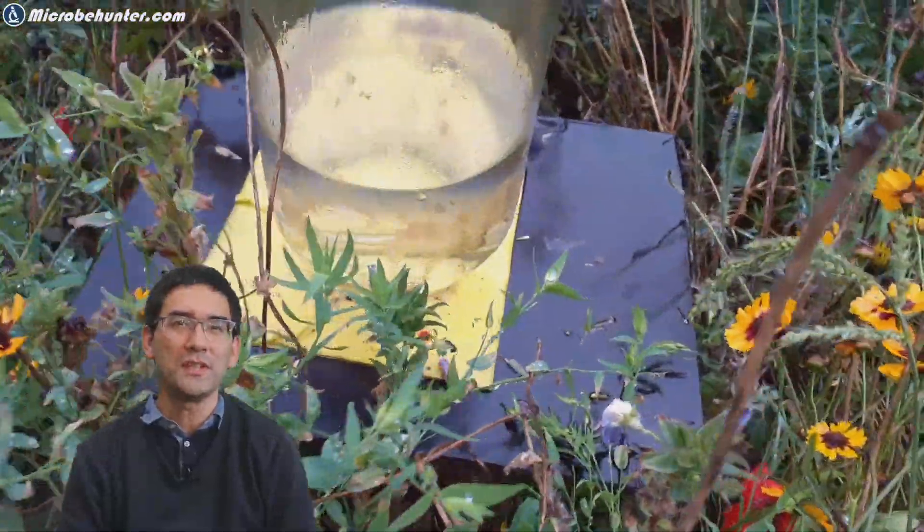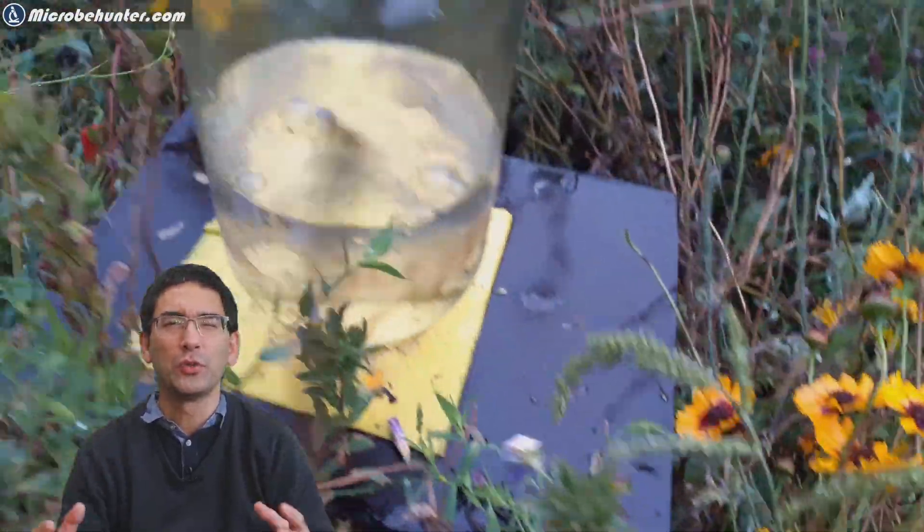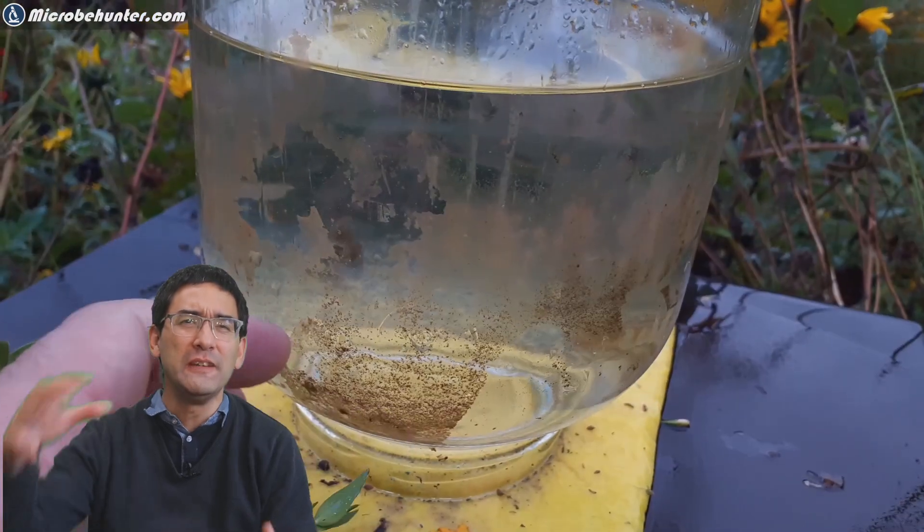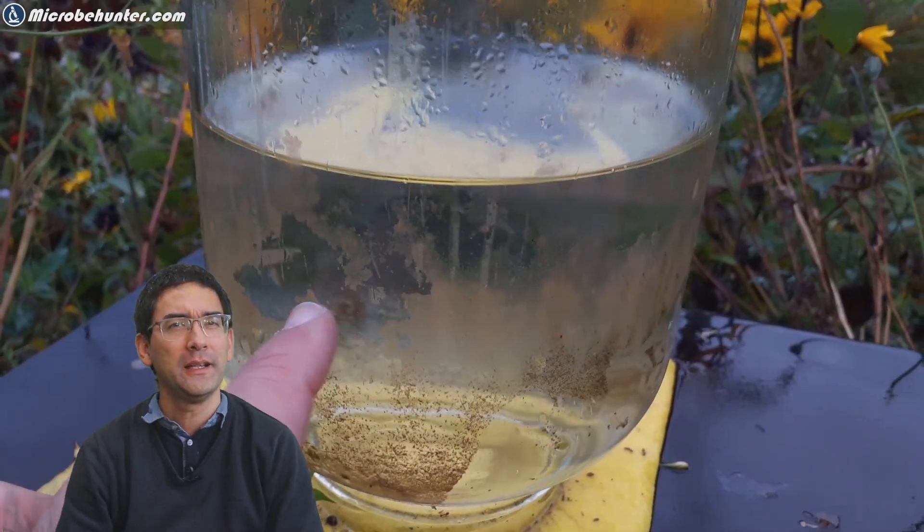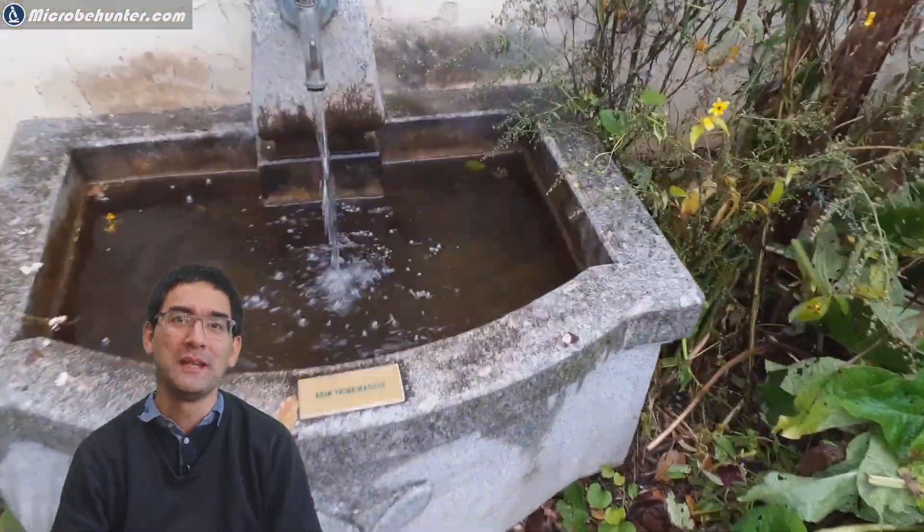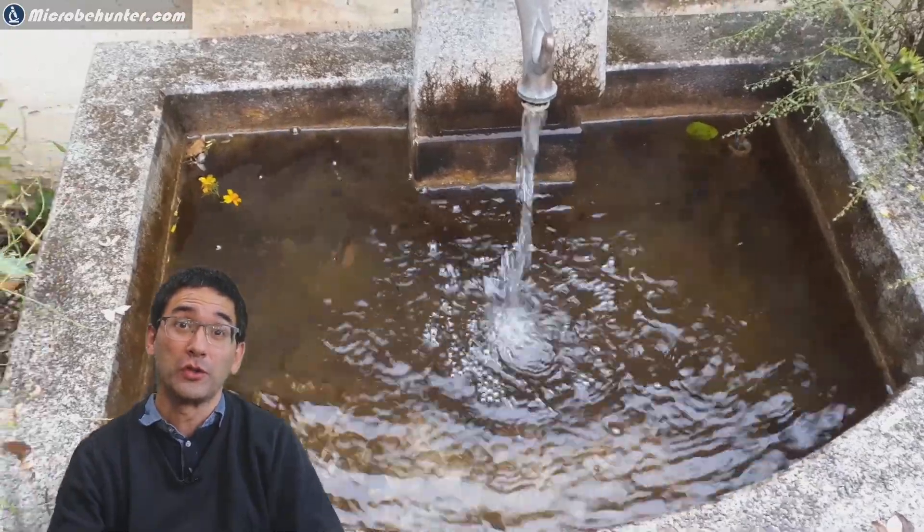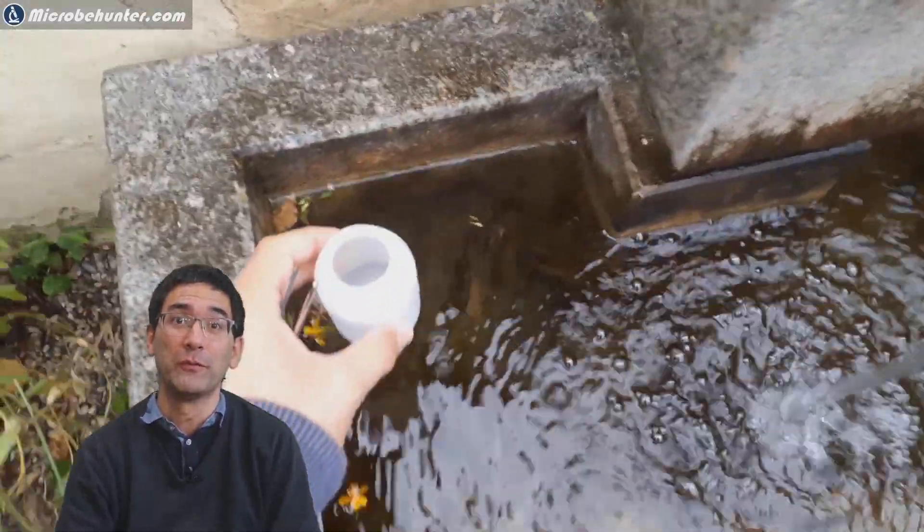I found an interesting water container. This was an inverted glass jar, and if you look very carefully on the inside, there was of course something growing, some algae. I wondered what this is, and I think it must have been a place for bees to get water, to drink water. Somebody must have set it up for the bees.